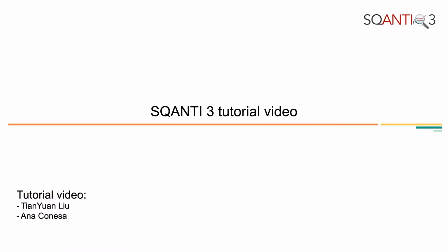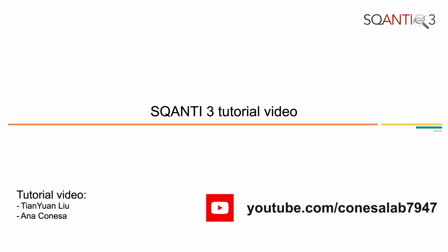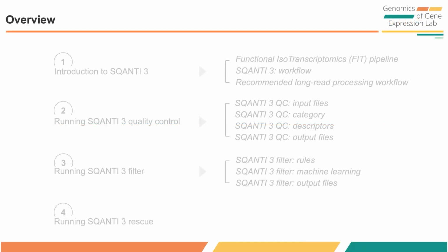Welcome to the SQANTI3 tutorial video from the CONESA YouTube channel. SQANTI3 is the leading software for long-read defined transcriptome quality control and filtering. In this video, we'll explore the key features of SQANTI3.